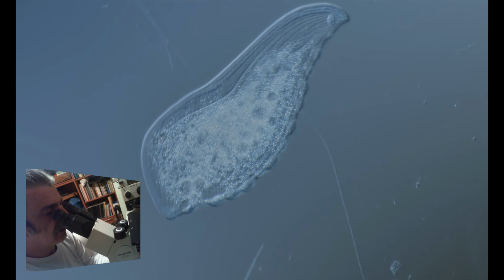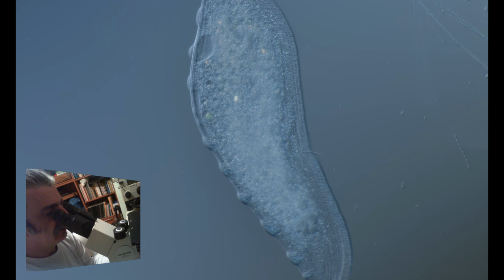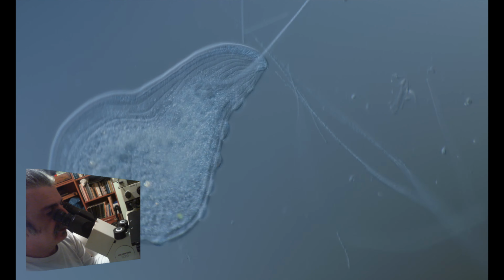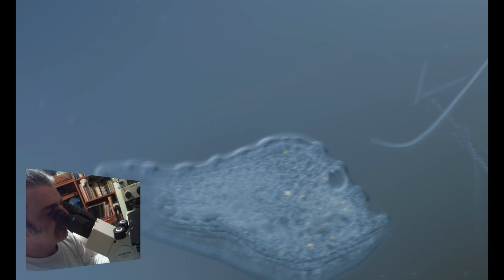And it has its nuclei scattered all around its body. On the left side you can see those lumps, what are called warts, one of the characteristics of this genus. Back to 10.